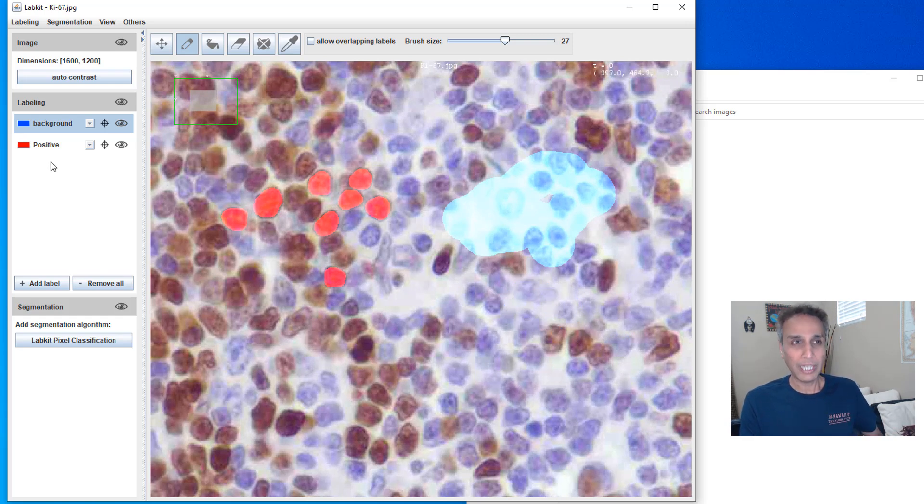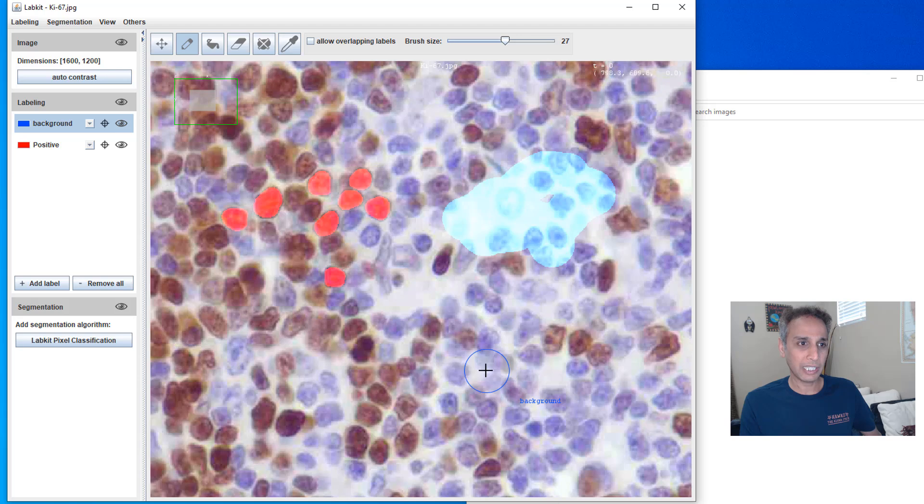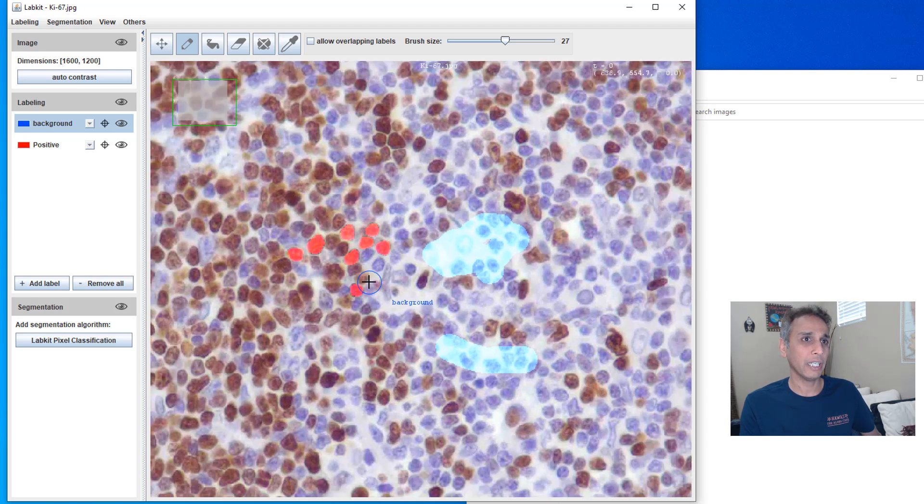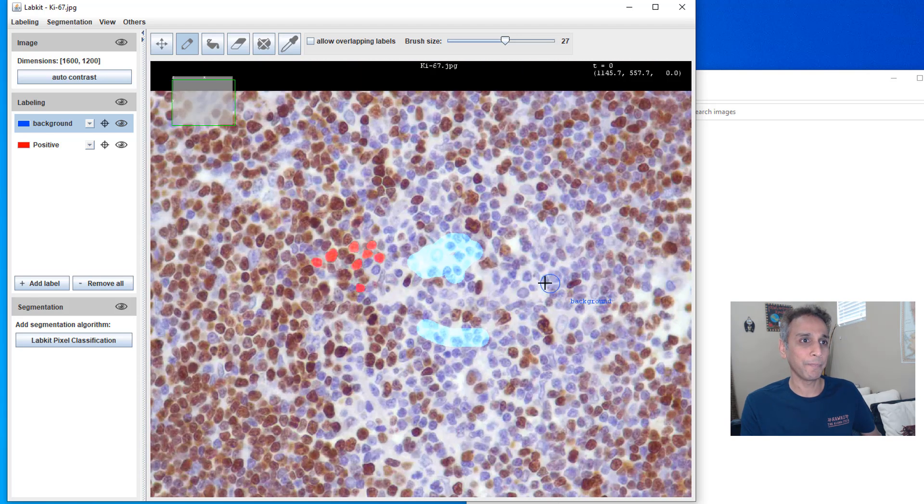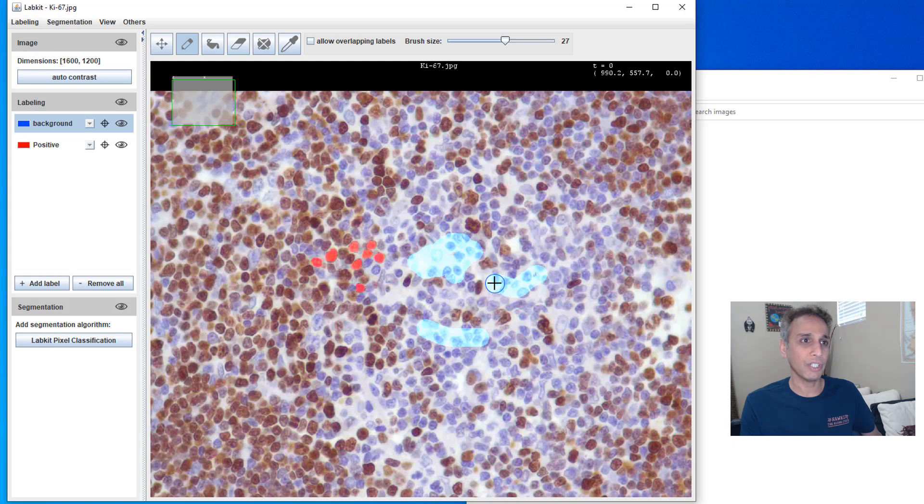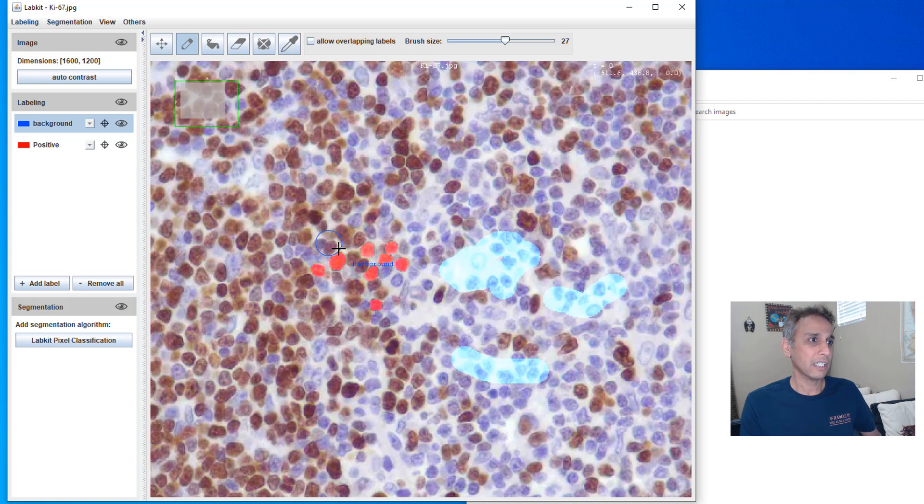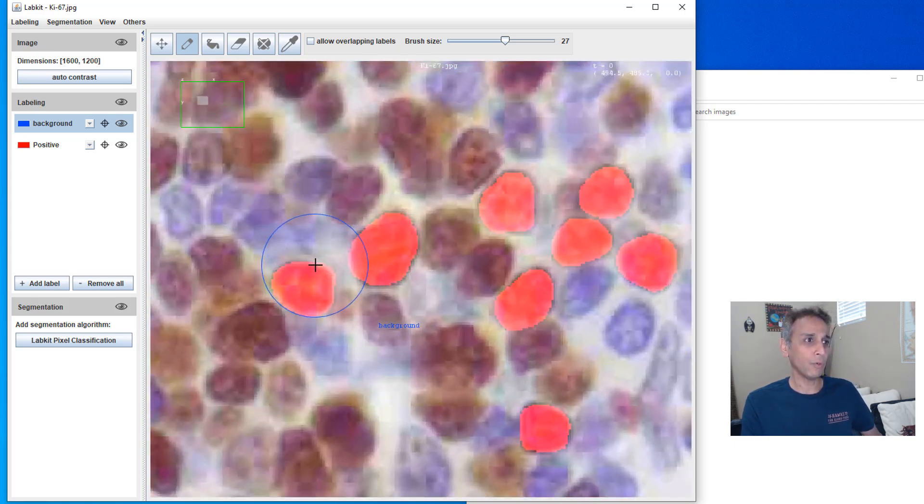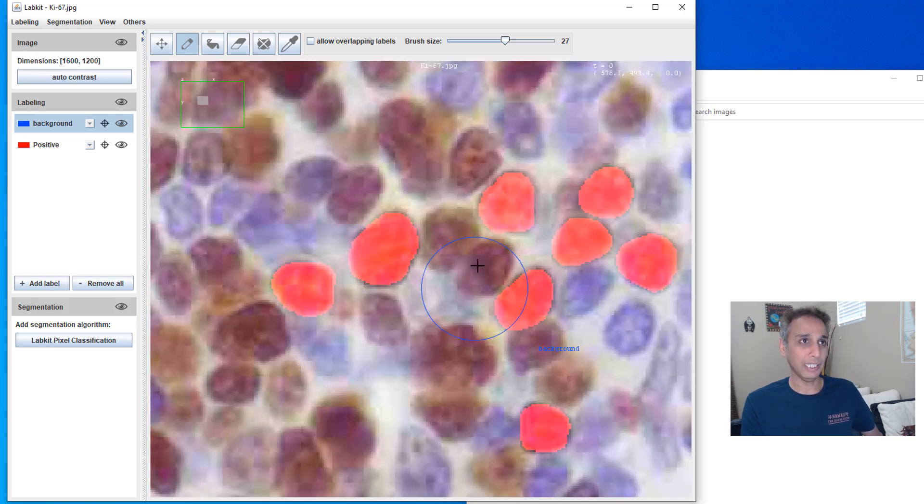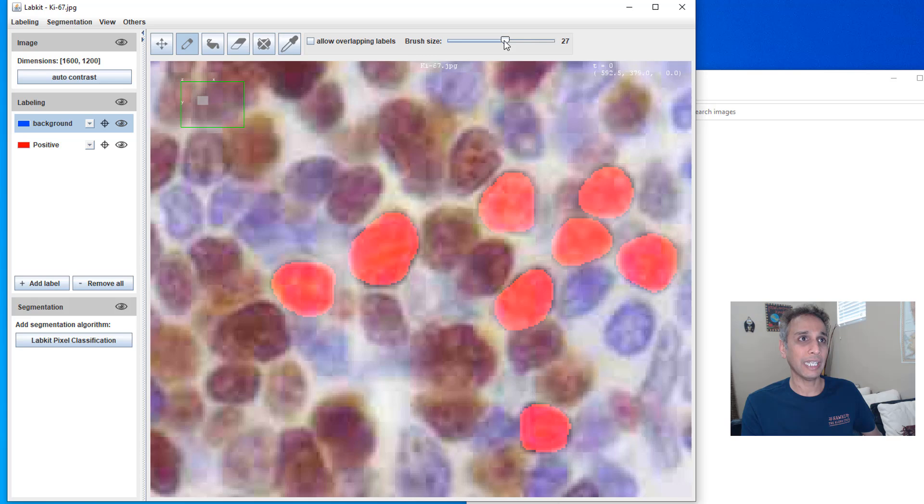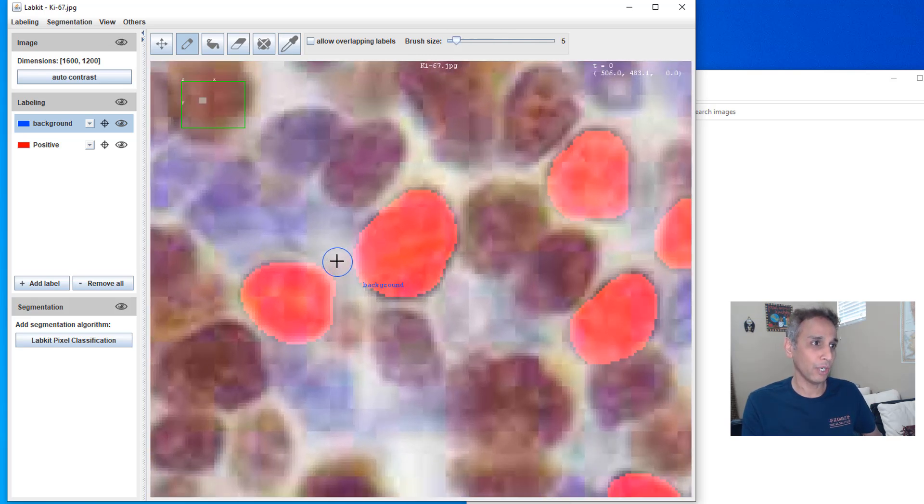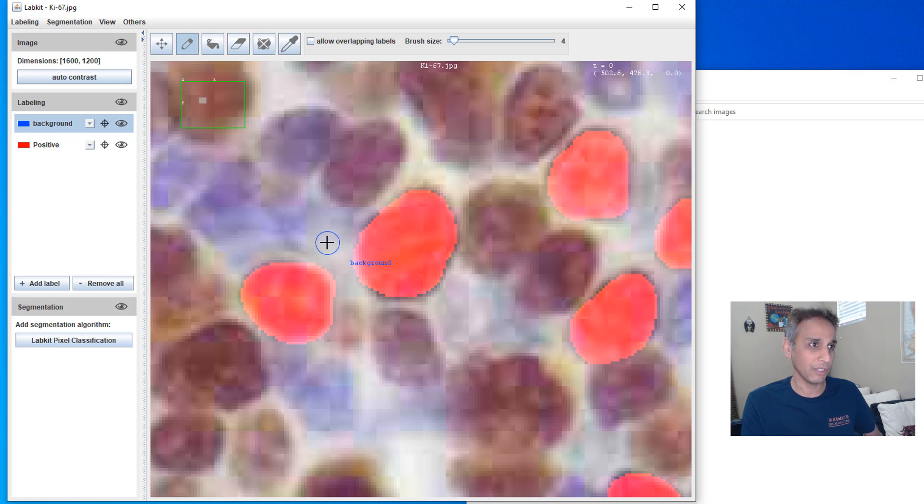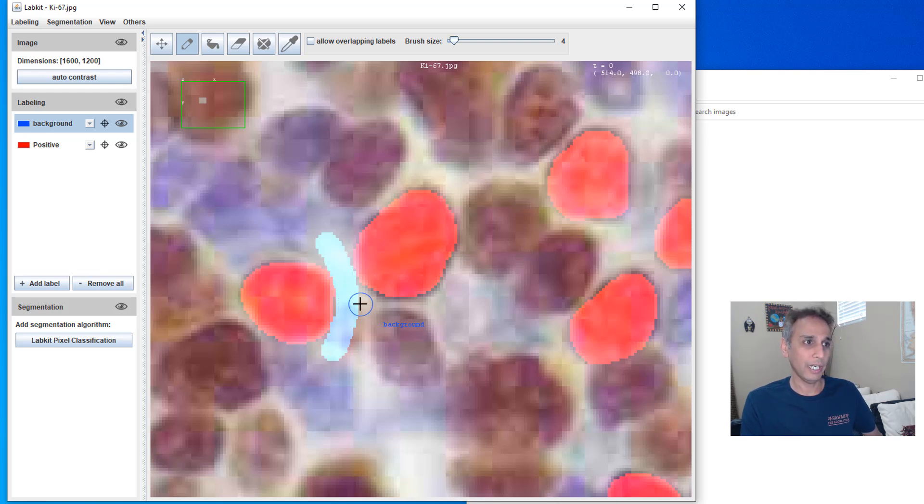Okay, now let me define some background regions. So I'm going to go to background and increase the size and all of these blue nuclei is my background. I do not want them to be included.